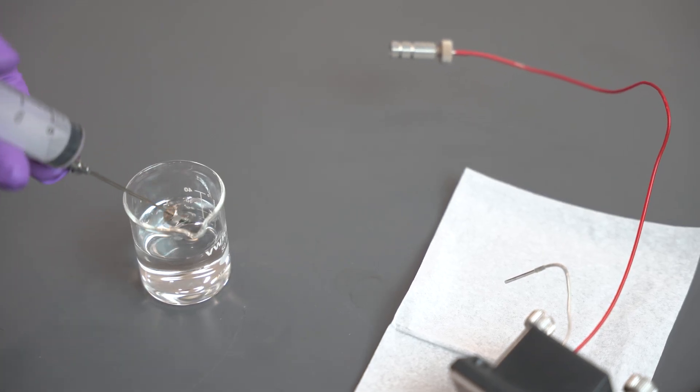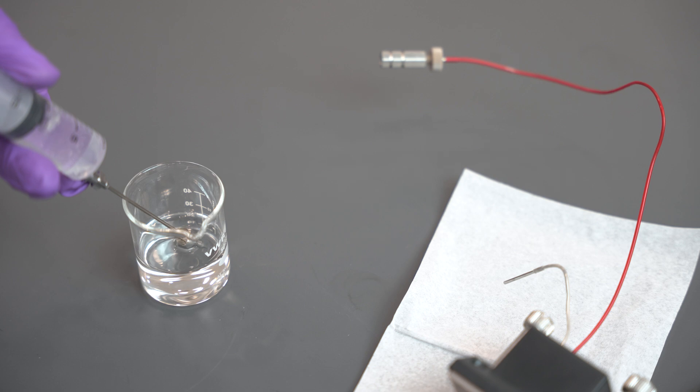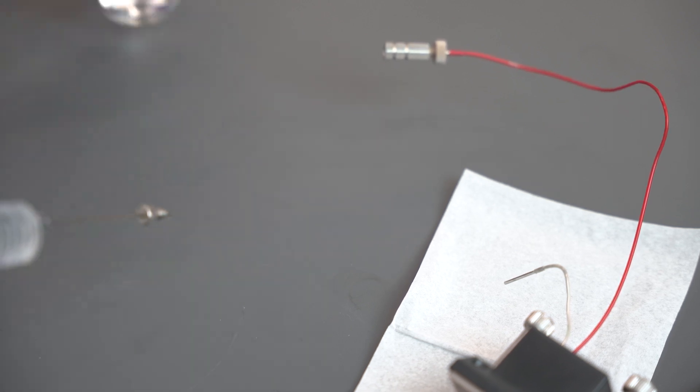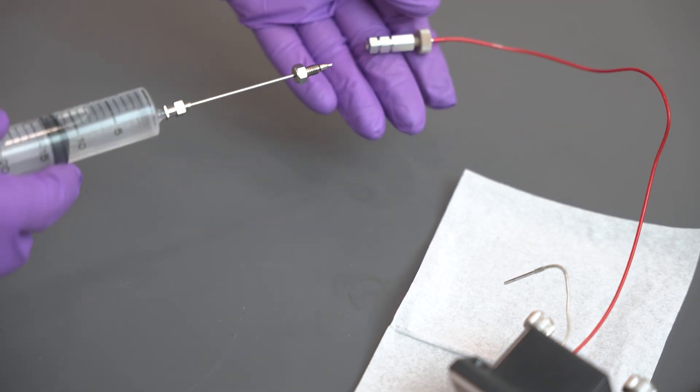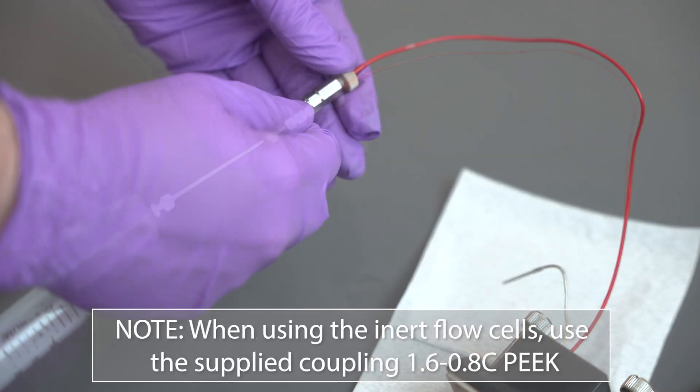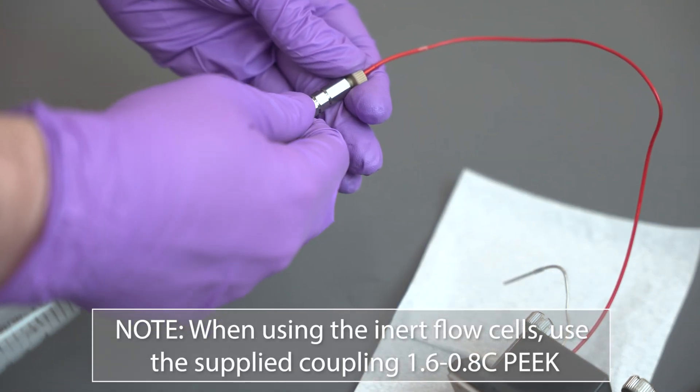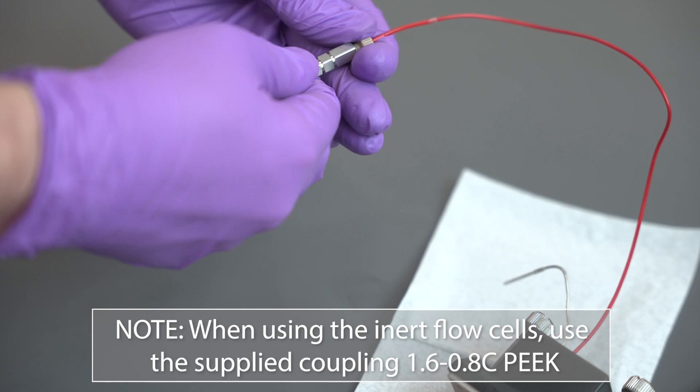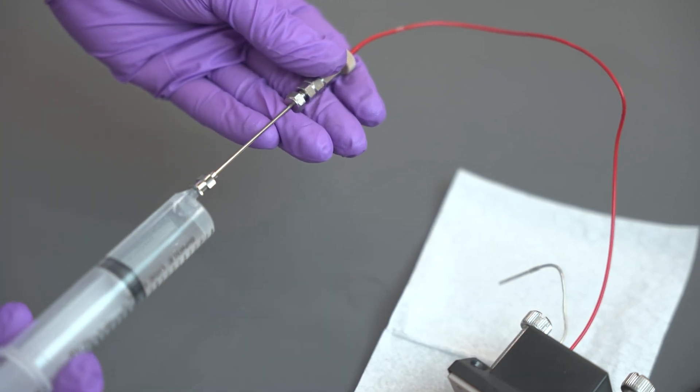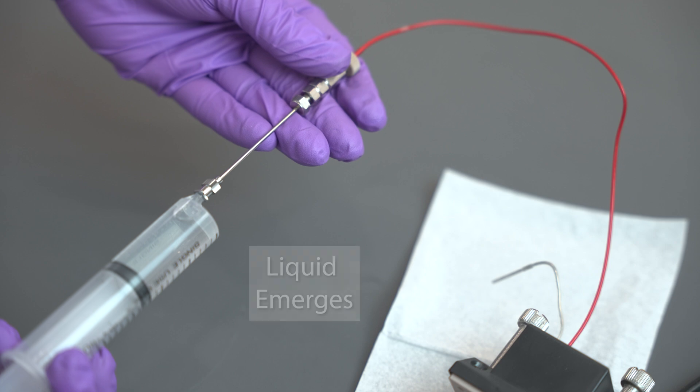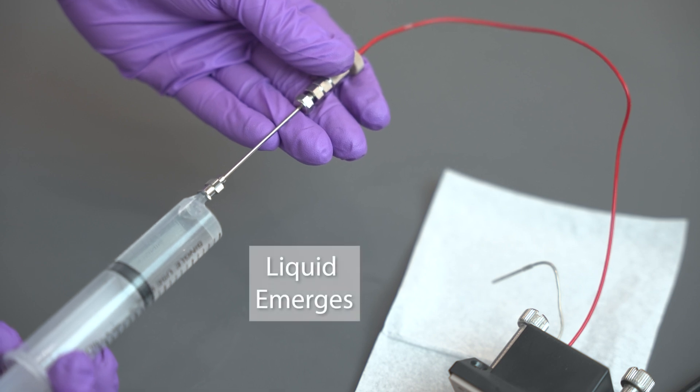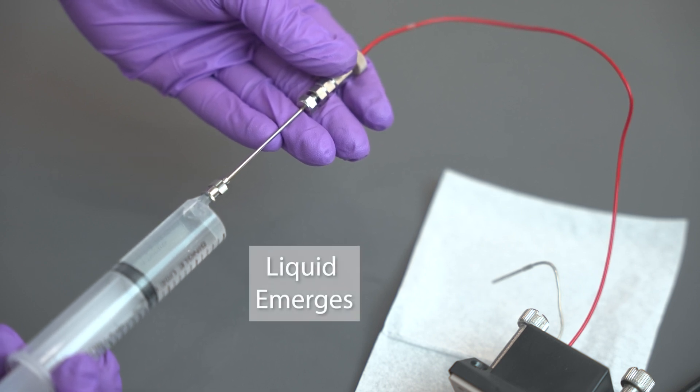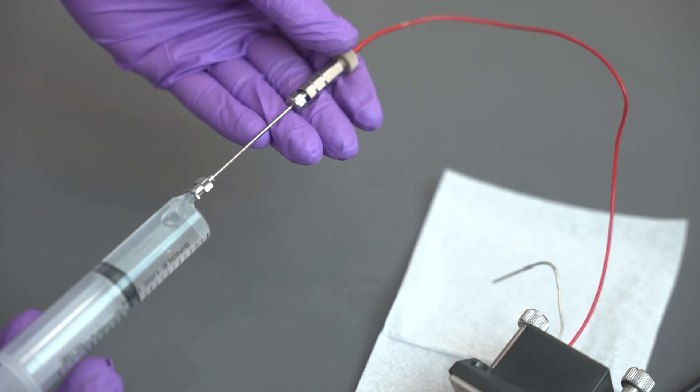Fill your syringe with 2-propanol. Attach the syringe with the needle that is equipped with the nut and ferrule to the inlet union of the flow cell. When using the inert flow cells, use the supplied coupling 1.6-0.8C PEEK. Push 2-propanol through the flow cell slowly until you see liquid emerging from the outlet tubing. If there are leaks, repeat the previous steps.